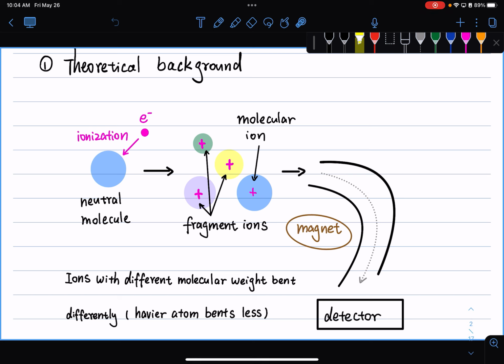All right, so imagine you have a molecule, and now we're shooting it with electron beams. These electron beams are like little guns, and whenever your electron beam reaches that molecule, we're breaking that molecule into small fragments. And these small fragments are charged fragments. Now they have positive charge. And depending on where you break it, you have ions with different sizes or different mass.